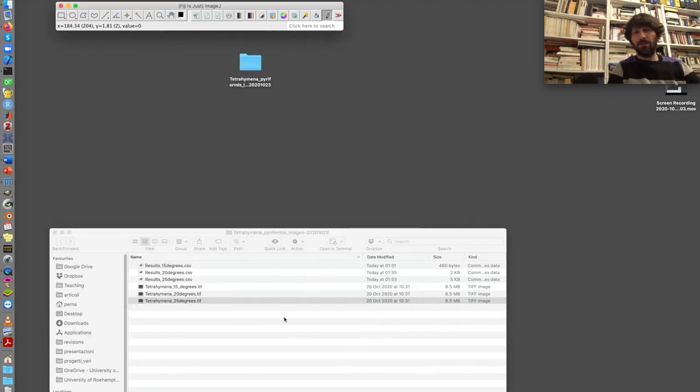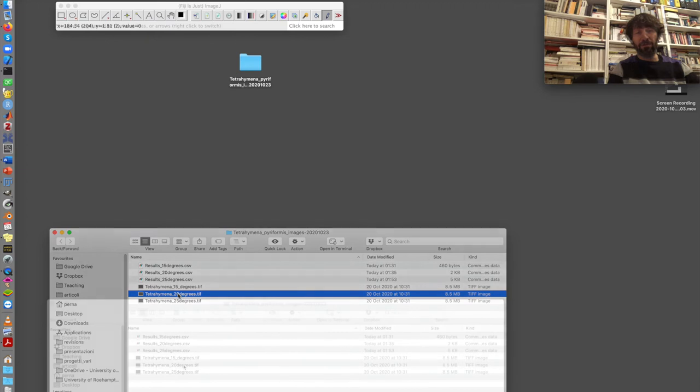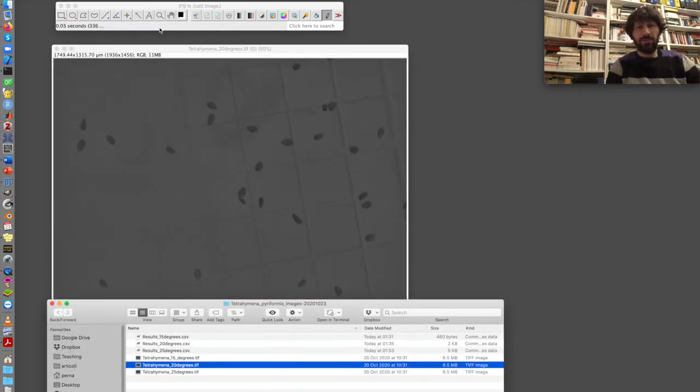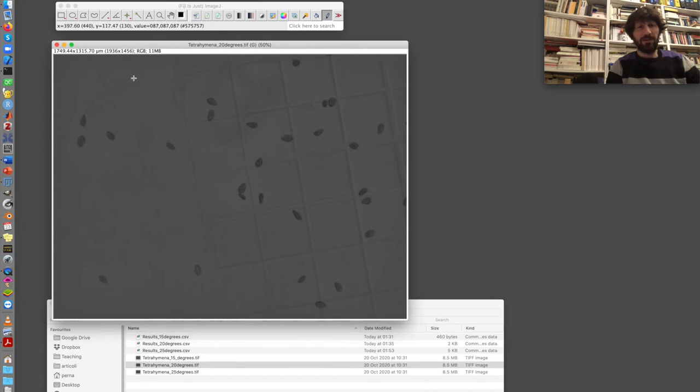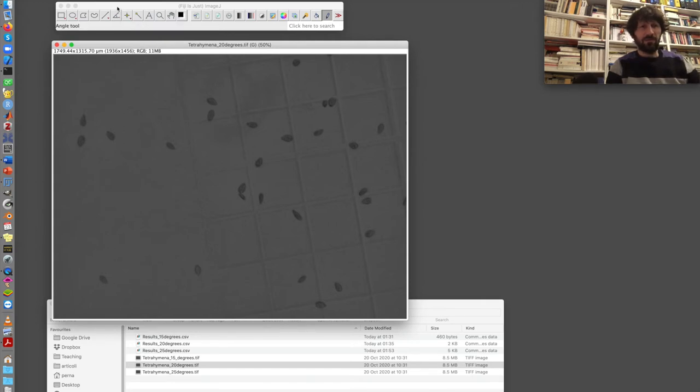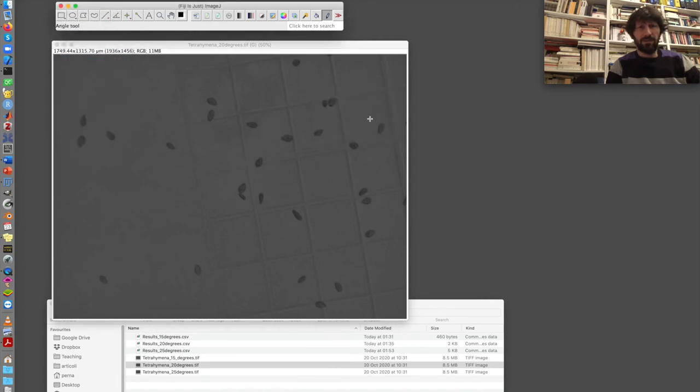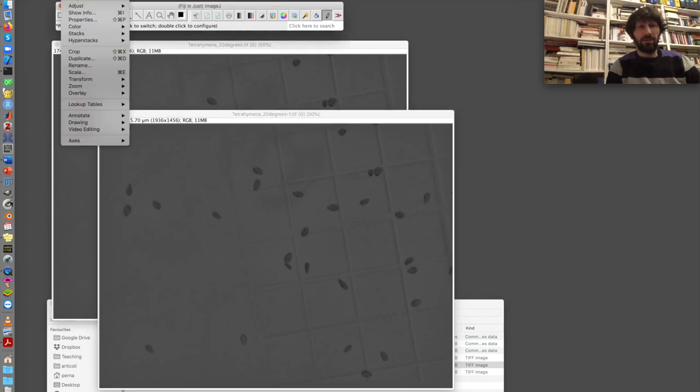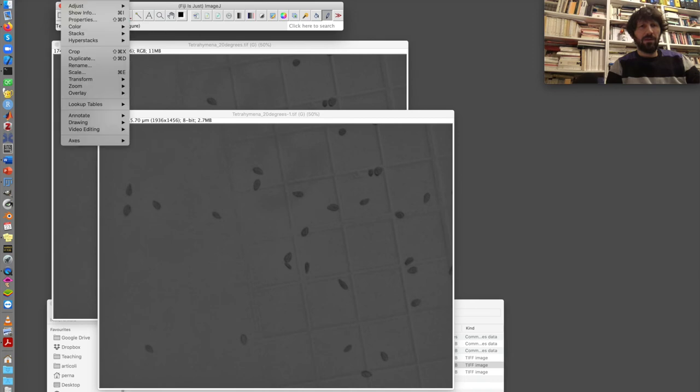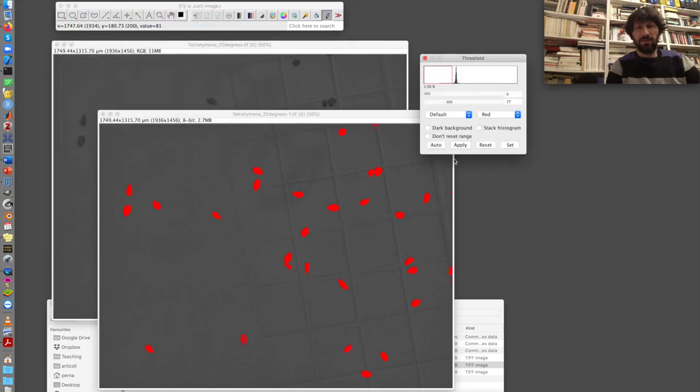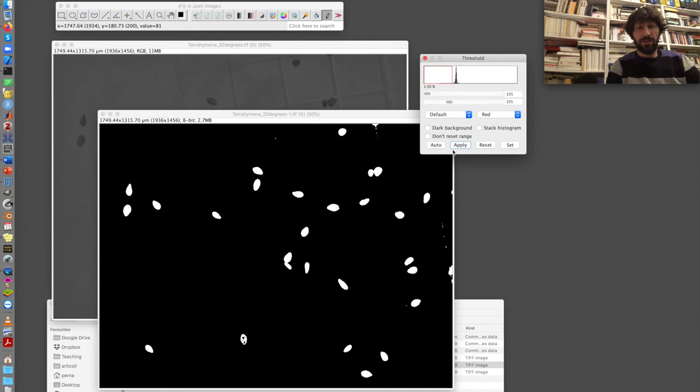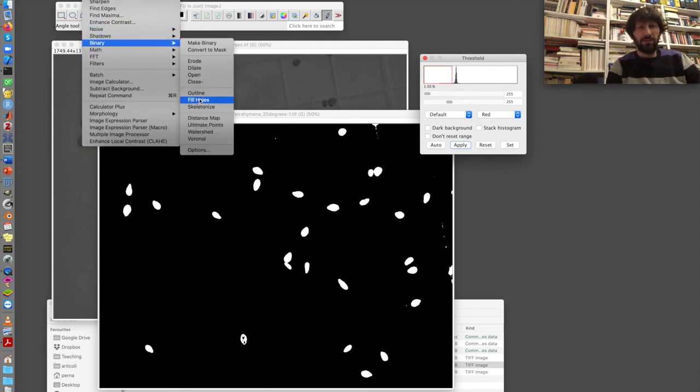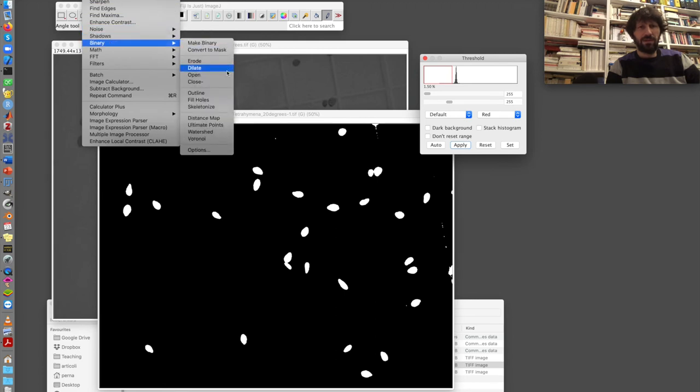There is only one more thing that I wanted to show you, using the plugin MorpholibJ. So I open this image again on 20 degrees, and I run the first steps again. But before doing this, I duplicate the image. So I go to image, duplicate. I have two copies now. And I run the analysis on this copy. So image type 8-bit. Image adjust threshold. Apply. I fill the holes first, and then watershed in this case. Process binary fill holes. Process binary watershed.